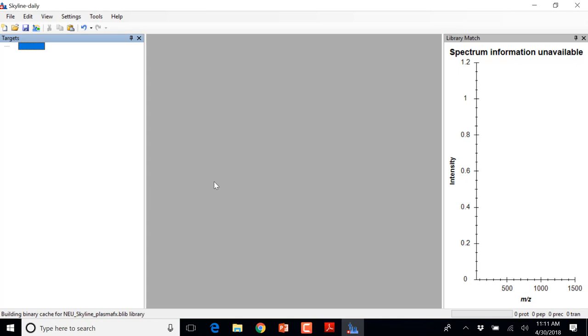Yes. So the ranking is on the intensity or spectral count? Which is different? Whatever you like. I don't think there's general consensus across all of mass spectrometry. I think some people do favor spectral count, or what you said.